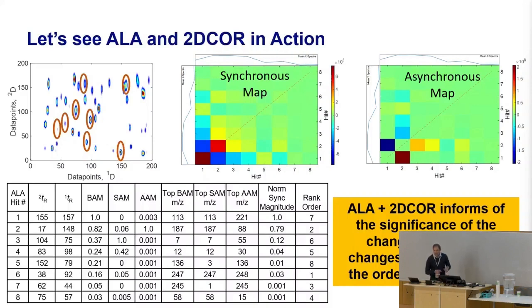So if we're trying to draw these decomposition pathways with all this information, now we know, hey, this is a key marker for us to pay attention to, but it's not the first thing that happens. If we get all the way down to here, our explosives have aged pretty aggressively, and that's a problem.